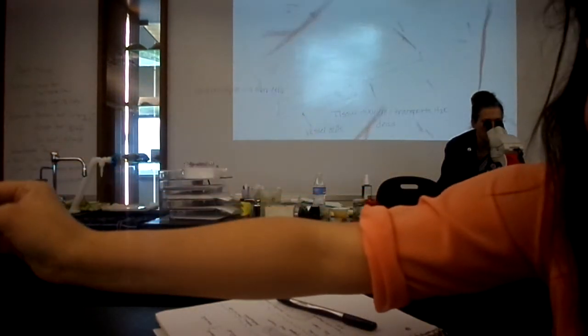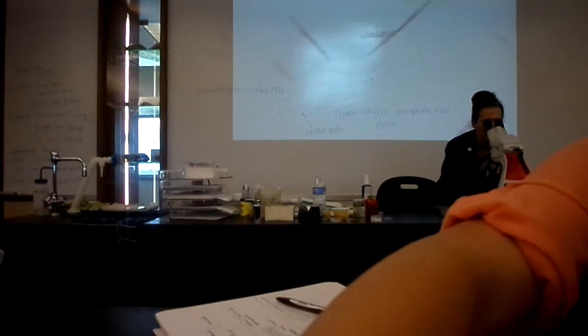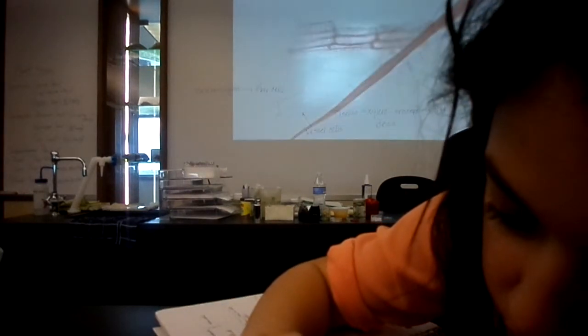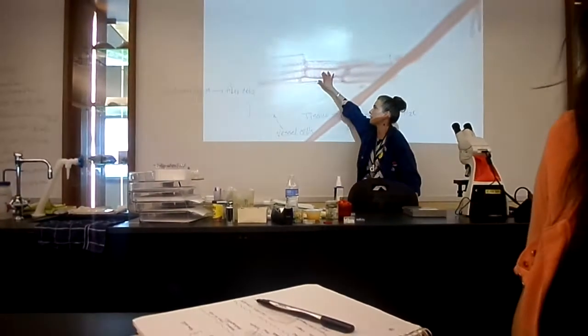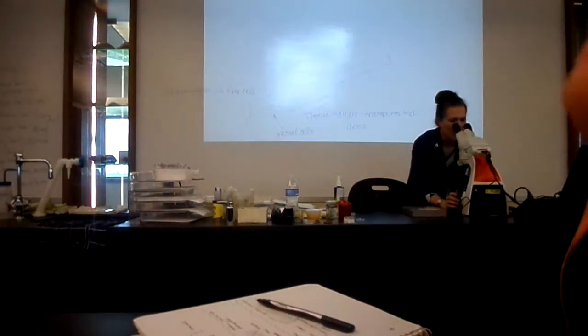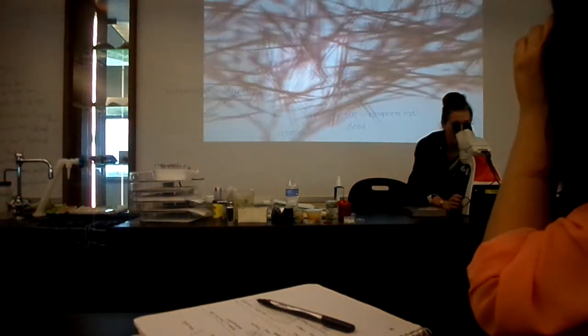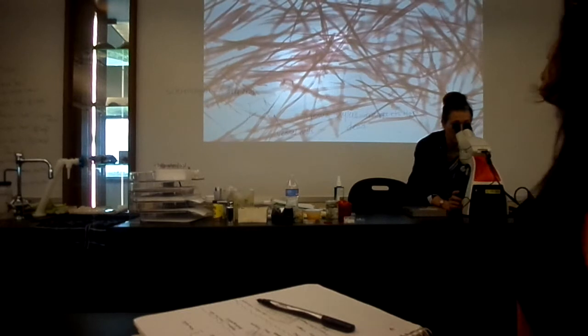Most of what you see here are fiber cells. These are some more vessel cells that are hanging around in a group. And I want you to notice that you have openings in them. They're little tiny holes in them. So there's another little cluster of vessel cells there. So like the whole square is the vessel cell? Each cell is called a vessel cell.